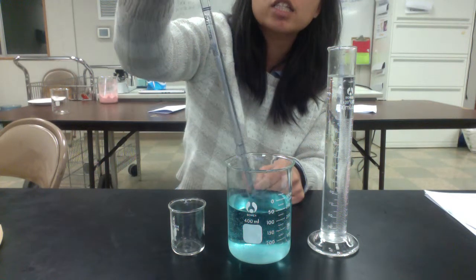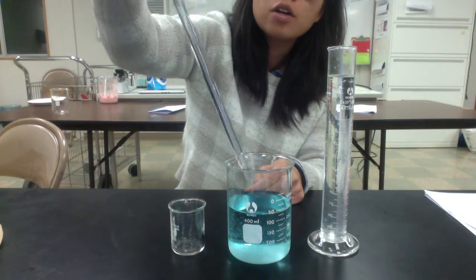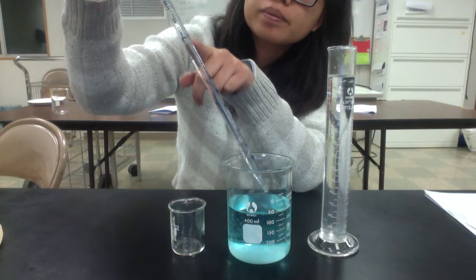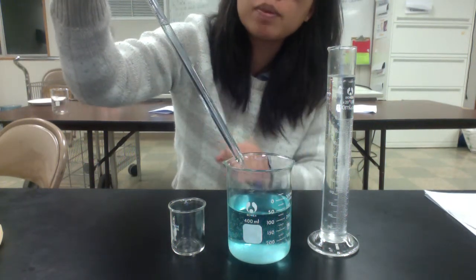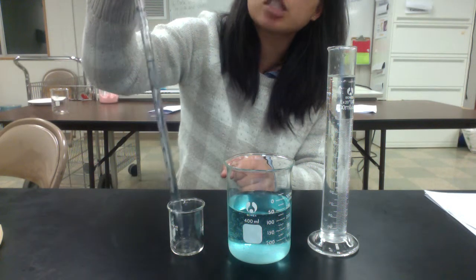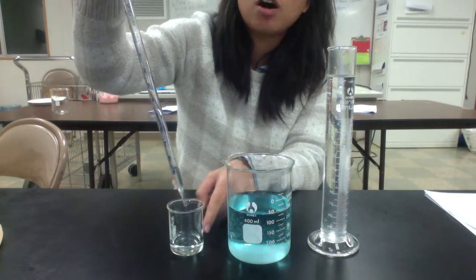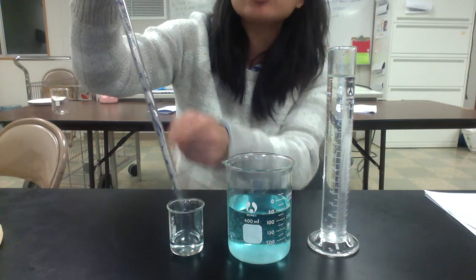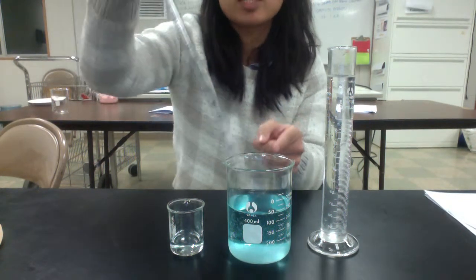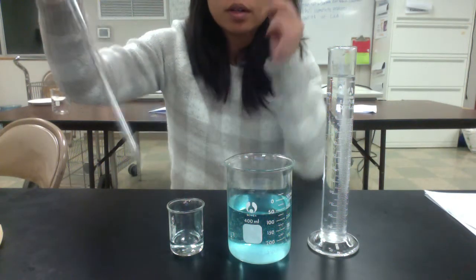If you want to transfer 20 milliliters, you're just going to suck up until it hits the 0 line. Make sure there are no air bubbles. And then to eject the liquid, there's a button on the side. Just press that button, and it's going to eject all of your liquid down. These tubes are for 10 milliliters at a time, so you're going to need to do this twice to transfer 20 milliliters total over.